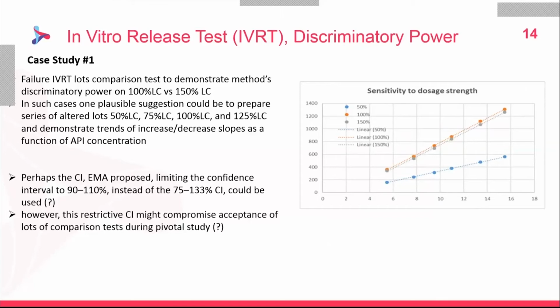However, in some cases, when in the product matrix the API is presented at saturation level, either dissolved or suspended at saturation level, any efforts to add more API lead to precipitation in the matrix. We had a case where making even 120% label claim was challenging without breaking the matrix.